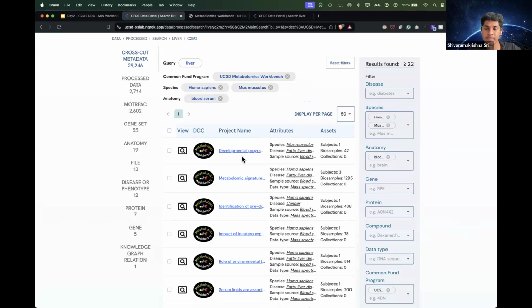So what's also interesting here with the cascading filters is that they're all neatly alphabetized, and you can always start typing in a few key letters, and it auto-completes and gives you only the filter that you want to view.